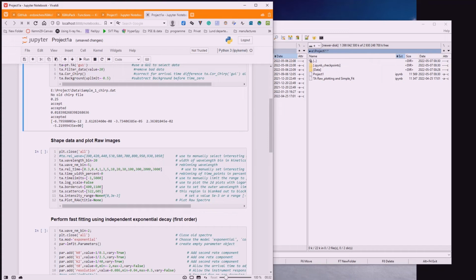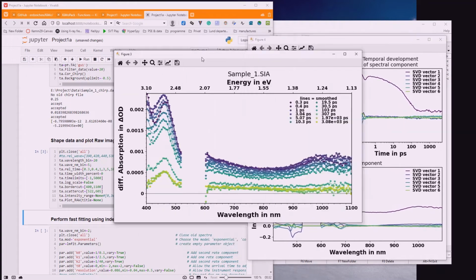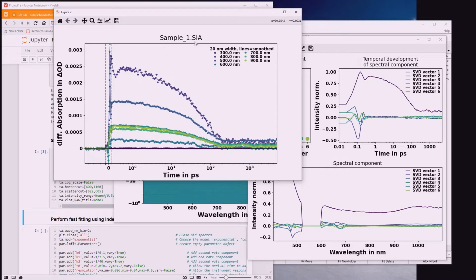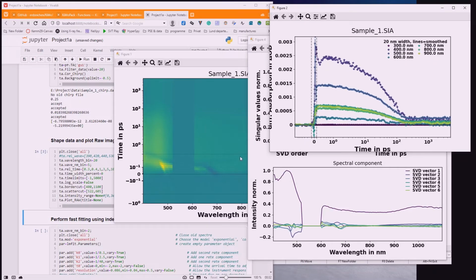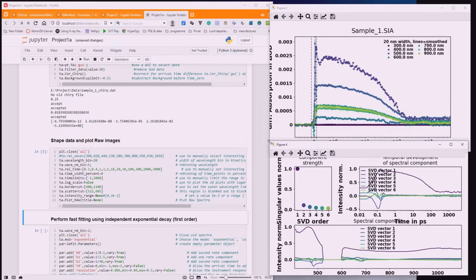Now I start by plotting. I could use an advanced or set wavelengths, but classically just using the built-in versions is good enough for a first look. Plotting raw, as before, generates my wavelengths where I have cut out my scatter cut. It generates my kinetics, which we want to use for looking a little bit more into. It generates my measurement matrix, and it generates my SVD, which we're also keeping.